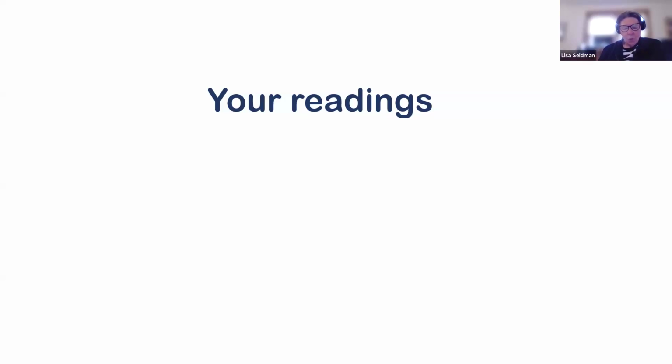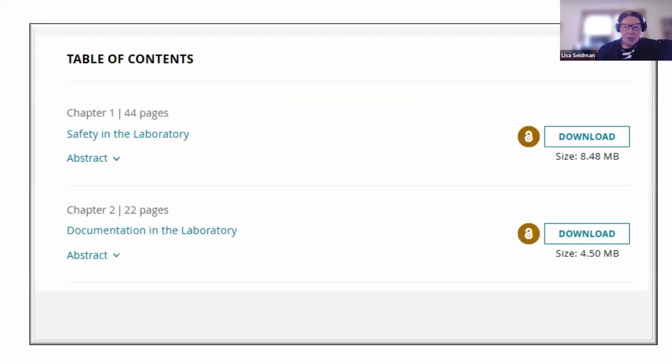We're going to suggest that if people have comments, we wait till the end, when we hope to have time for discussion and questions and answers, and maybe talking about thermometer readings. At this point, though, with students, I would certainly talk about significant figures, and they're probably getting hit with that a lot in their chemistry classes around the same time. So that would be a concept we would want to talk about, but we're going to avoid that right now because we're just going to keep moving on.